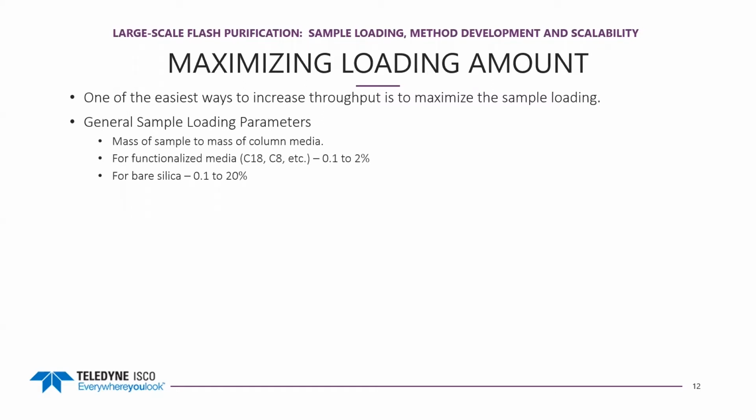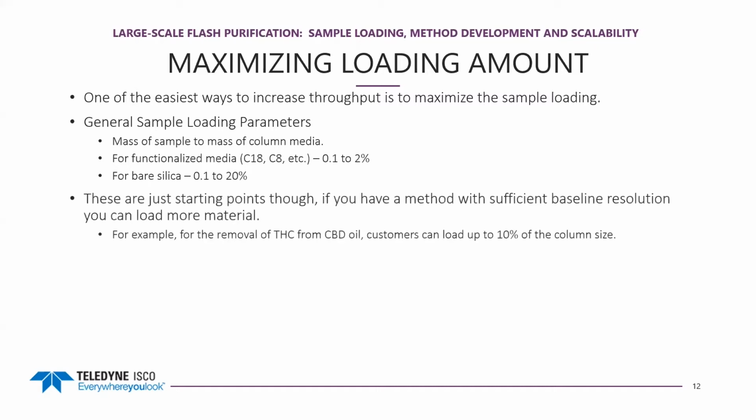If I'm using bare silica, we can go up to 20% for the bare silica. So for your REDISEP Gold, you can go up to 20% loading with its higher resolution offered from its spherical particle shape and smaller particle size. But these are really just starting points. If you have a method with sufficient baseline resolution, you can load more material.